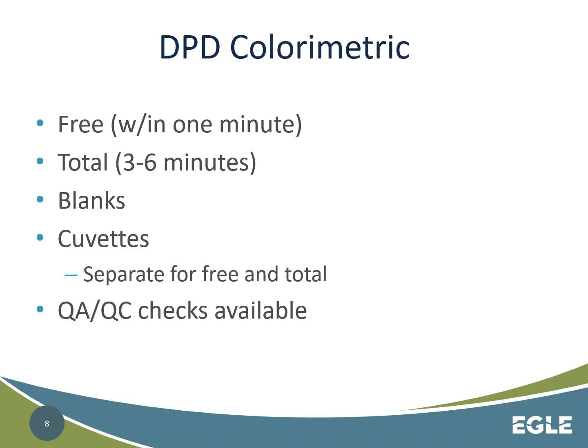Another thing to be doing is making sure your pocket colorimeters are properly calibrated. Again, this is done with standards that you order from the manufacturer of the machine to make sure it is reading accurately. The manufacturer will include instructions that it should read within plus or minus a certain value for that machine, particularly for that test, because the test and the machine you're using will change the acceptable accuracy to make sure it's within calibration. And this needs to be done quarterly, or at least a couple times a year, with your machines.